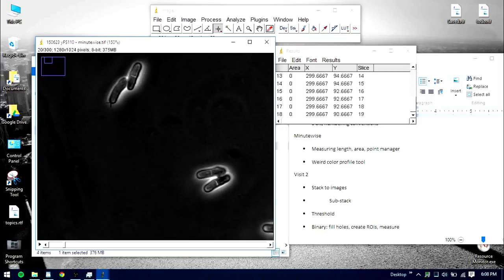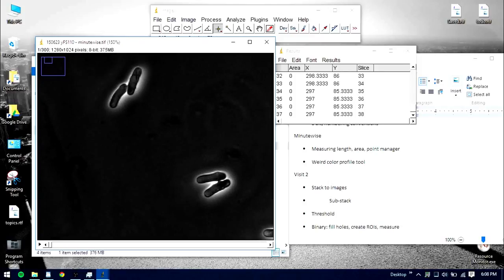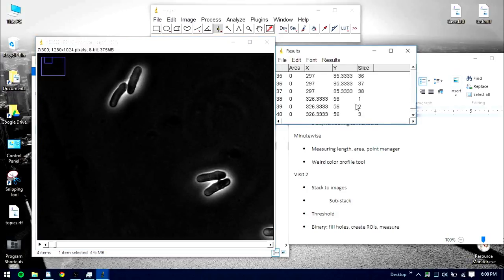And that way you can get these measurements done a lot quicker than if you'd had to draw a line every single time. And then once you're done doing that, you simply go back to the first frame and repeat the process again with the next endpoint. And obviously you'd probably dump that into Excel before you start over. And by doing that, you can put in a little formula to extrapolate the length of the line that you would have drawn, and that makes your measurement A, a lot quicker, and B, a lot more accurate.